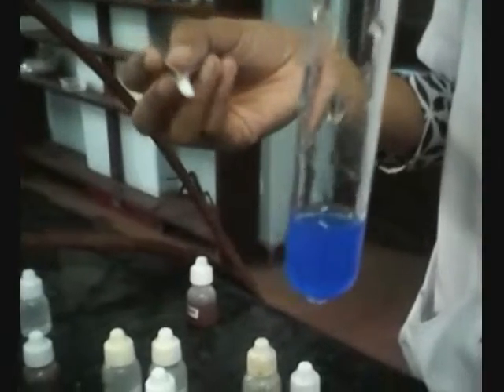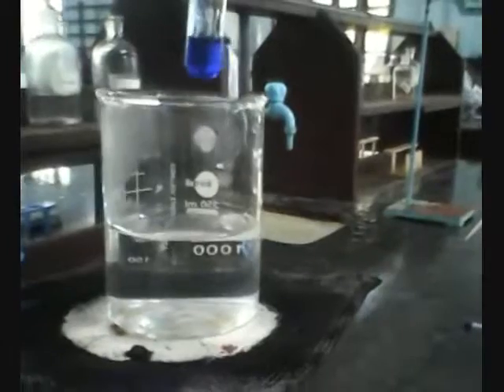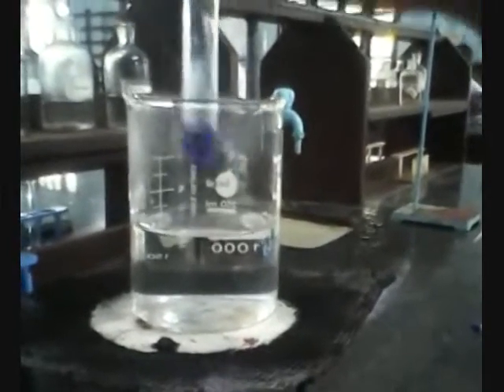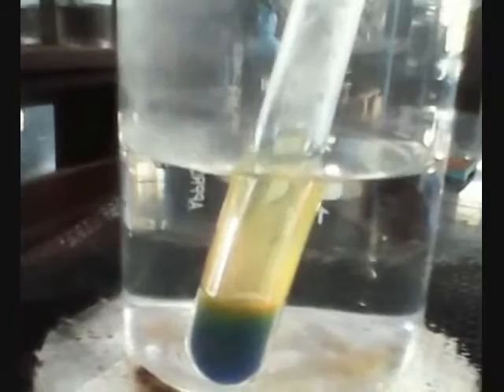To about 2 ml of Benedict's solution, add a little of the compound and heat on a boiling water bath for a few minutes. A reddish brown precipitate. The compound is a reducing sugar.